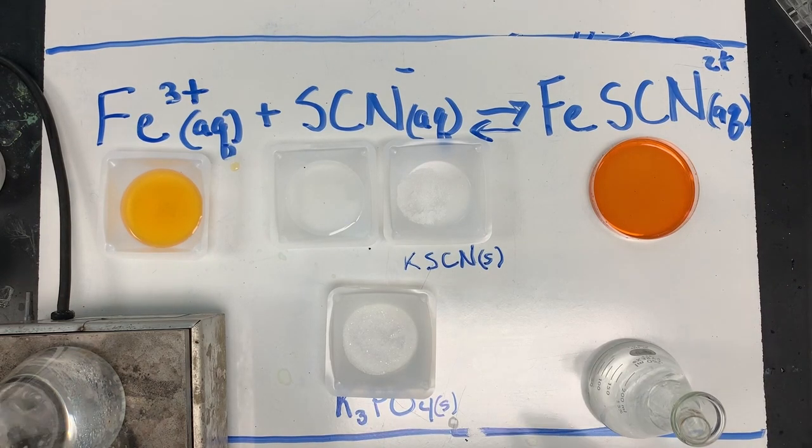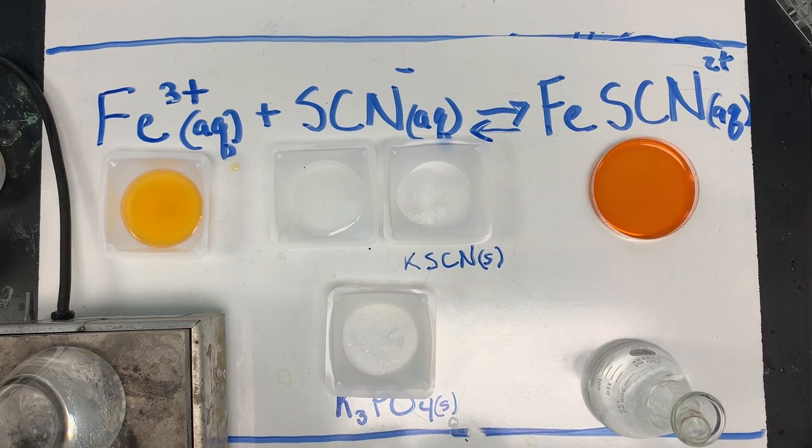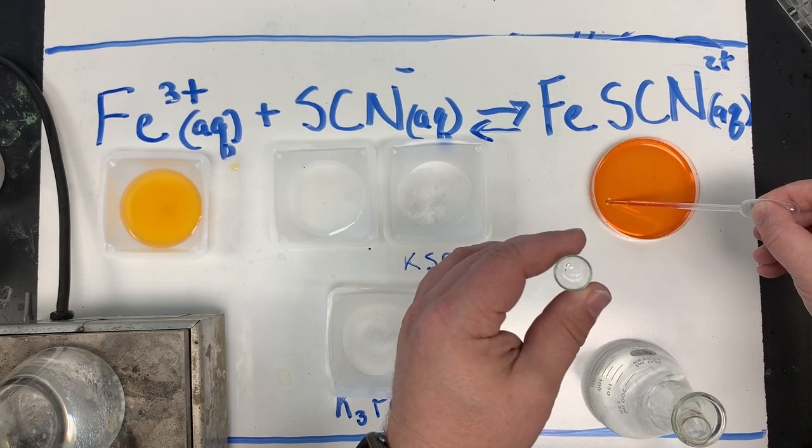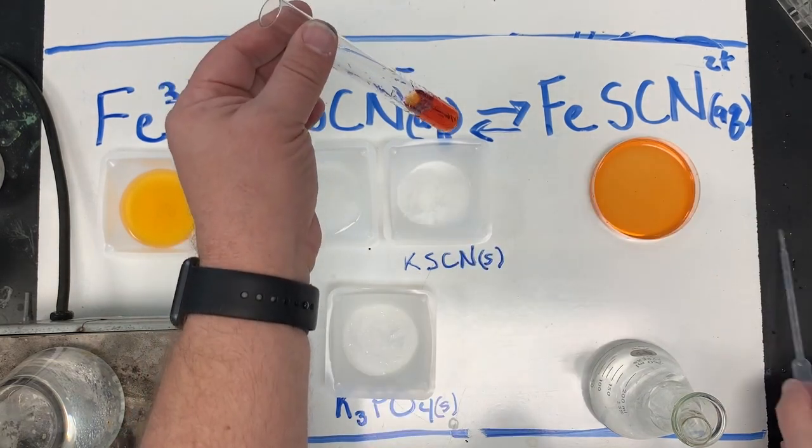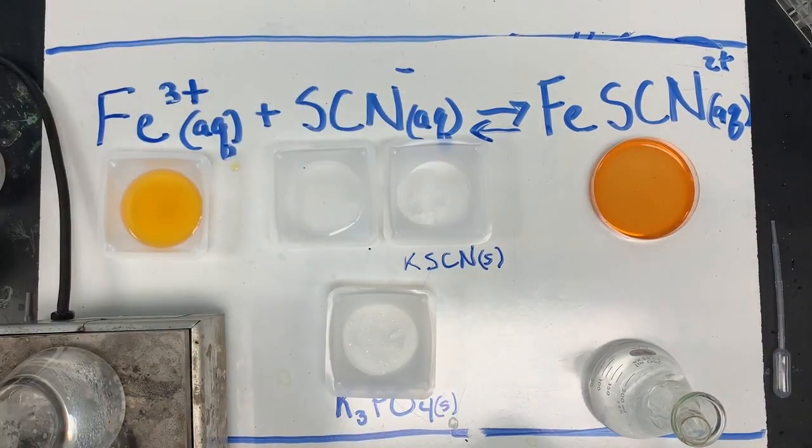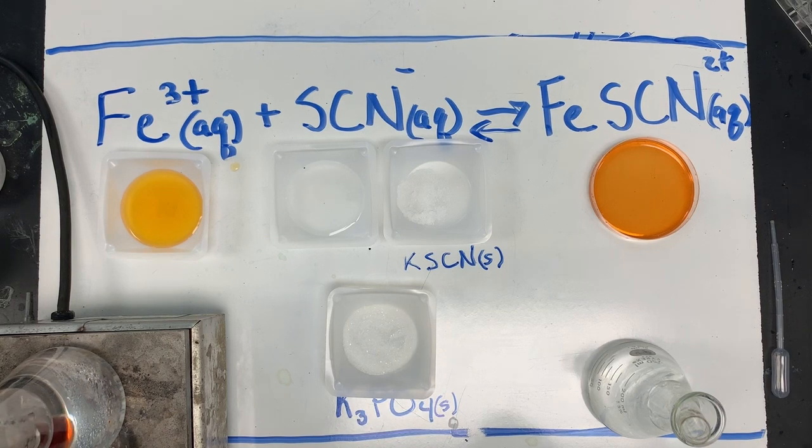So I have a test tube here, and I have a hot plate. And I'm going to take a milliliter, maybe two. Well, let's do about five. So you can see the solution in the test tube. And I'm going to place it in a hot bath. And we're going to let it sit for a little bit.